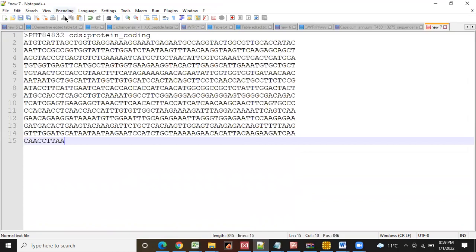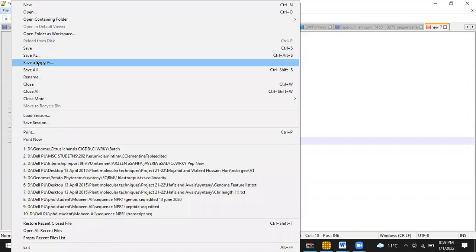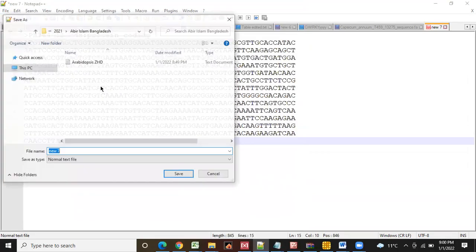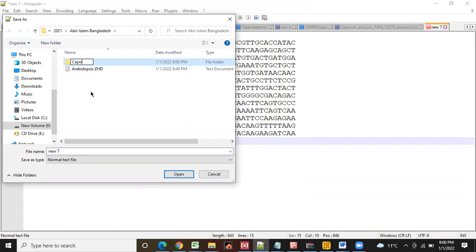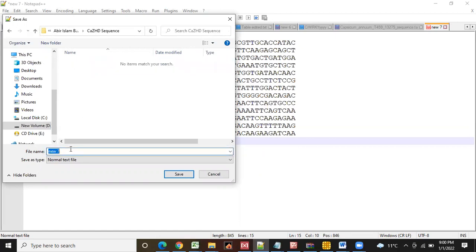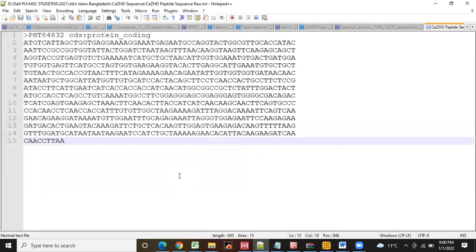Then we will save as a file. Here we will write Capsicum annuum ZFHD sequence. I just made the folder new folder. And then I will write here Capsicum annuum ZFHD peptide sequences, but in the raw form. I'm just so that we will copy all these proteins in the raw form.